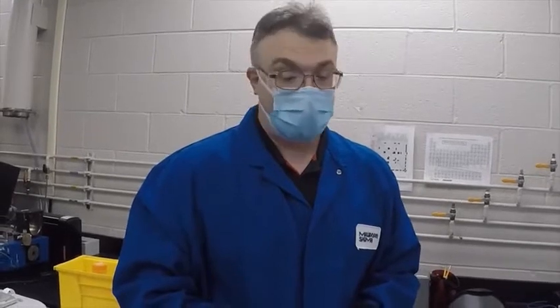Next, I would like to talk about protection for your body and clothes. When entering a laboratory, you want to make sure you're wearing some sort of protection for yourself and your clothes — i.e., a lab coat.